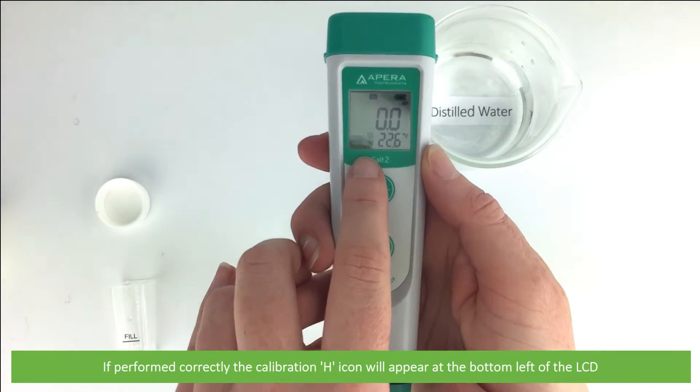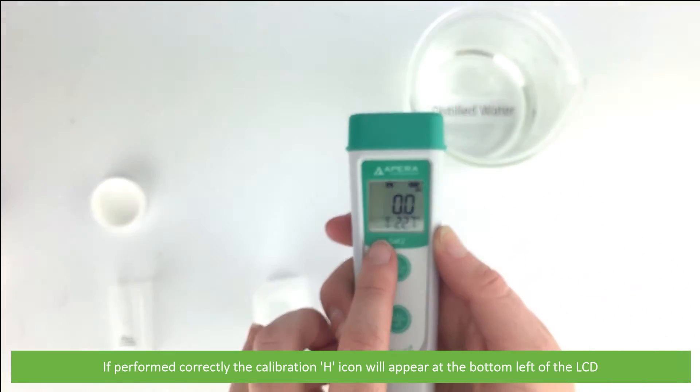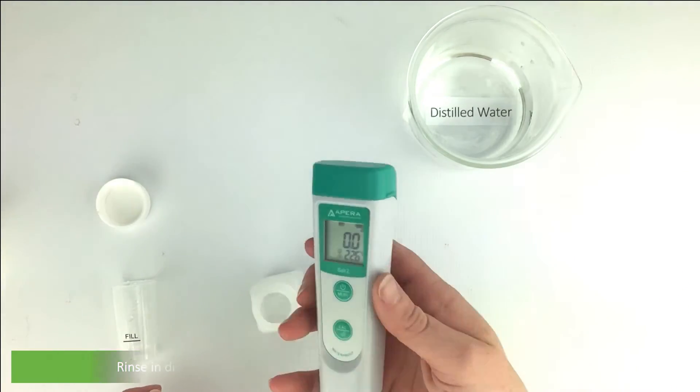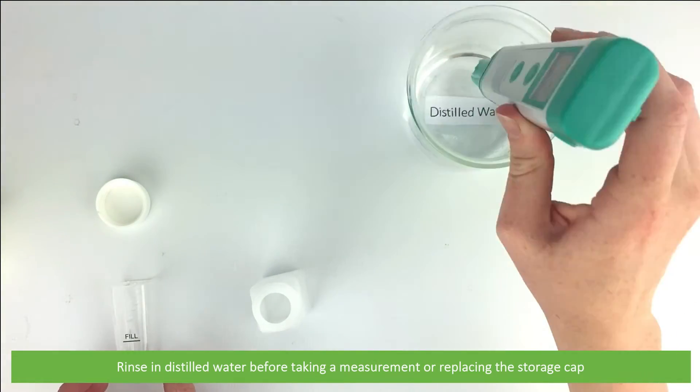If performed correctly, the calibration H icon will appear at the bottom left of the LCD screen. Last of all, rinse the device in distilled water before taking a measurement or replacing the storage cap.